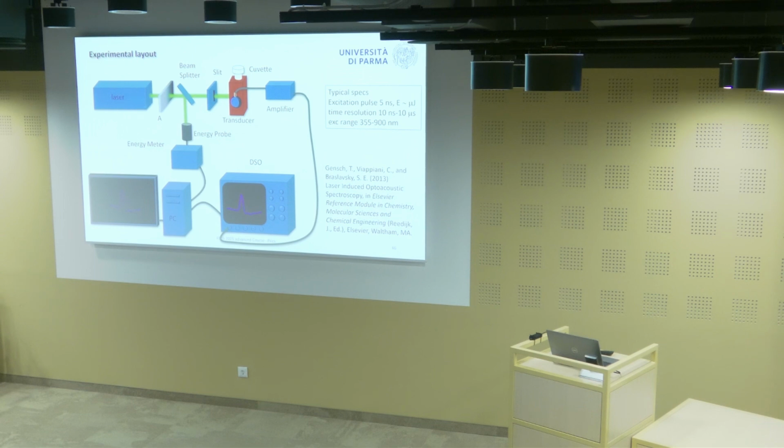The setup is very similar to any other setup we've seen before. We have a pulse laser, usually a nanosecond pulse laser. You monitor the energy of the pulses. You shape the beam with a slit, and then you hit the sample in a cuvette. And the transducer is one of those piezoelectric PZT transducers. You may not be aware, but they are identical to those they use in echography. So you know when they make imaging, they're exactly the same type of transducer. And it's a contact transducer, so you have to physically attach it to the cuvette.